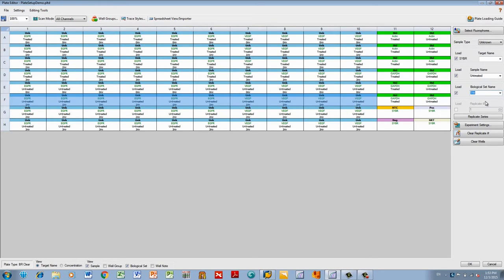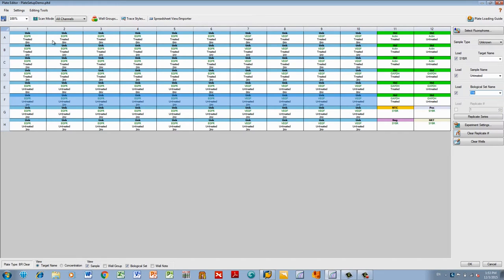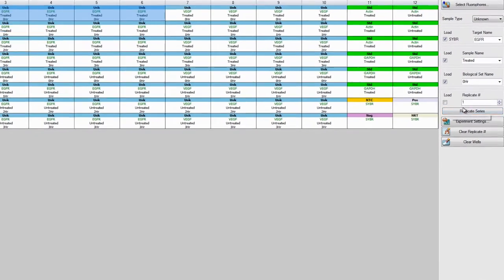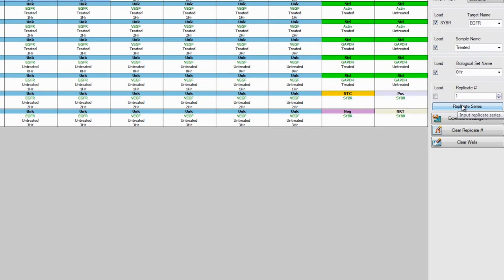To set up technical replicates, select all the wells in one biological set with the same target and sample type. This is very important. If there are any differences in the well types, you will not be able to assign them as the same technical replicate.